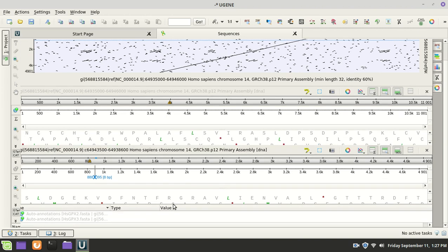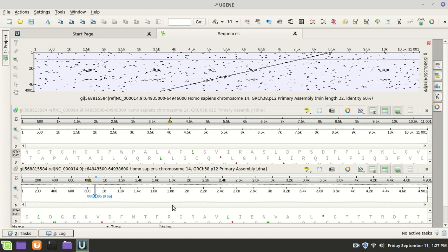Alright, what we have is they've sequenced these genes in opposite directions, and one is going one direction and one is going the other. They actually were quite similar, but we have opposite directions going on. In other words, one is the complement and the other one is the coding sequence. And they get this wrong and label it wrong commonly. So this is a good example of, you need to play with it, and if you're not getting what you want, you may have the wrong sequence.